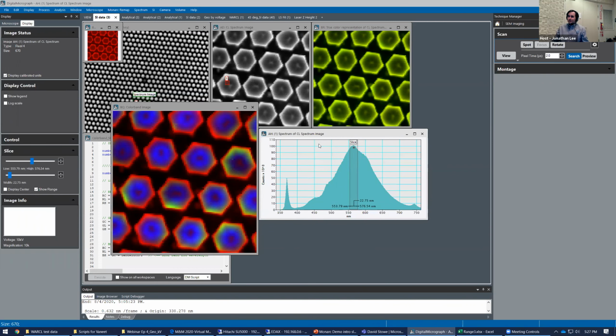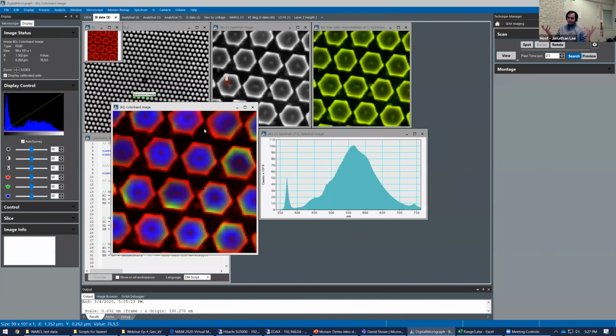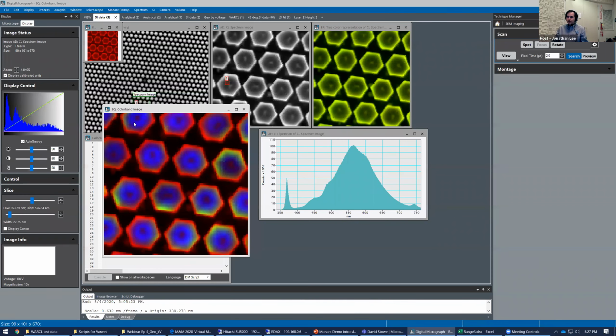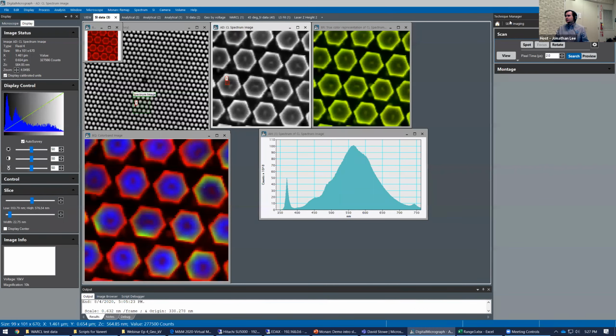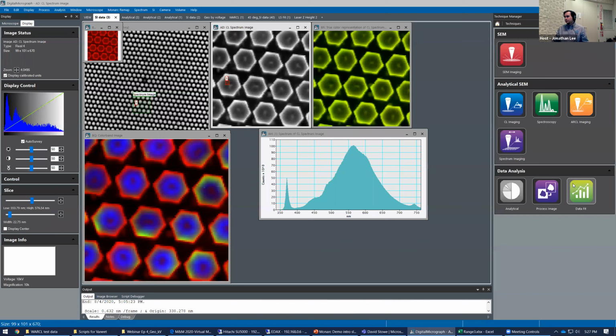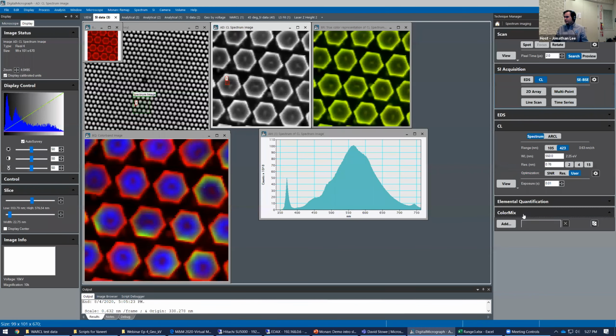And yeah, what I would typically do is generate a spectrum, and put red, green, and blue on the spectrum with a few pickers, because it's a 3-dimensional data set. It's very challenging to display to someone, especially in a paper medium. But there is the option to do video. I think, was it spectrum image? No.